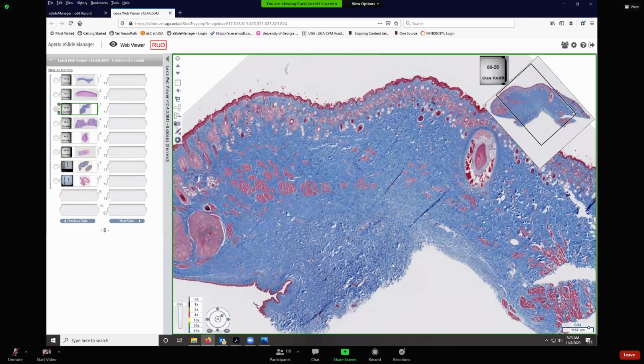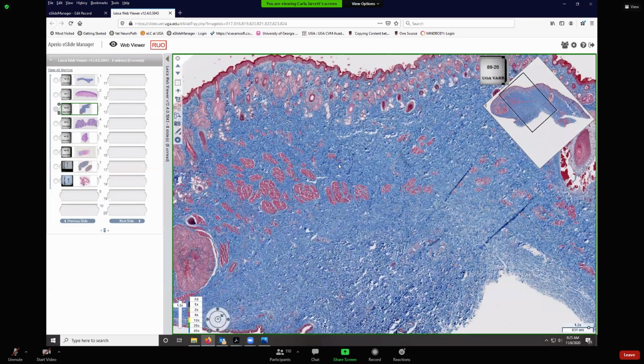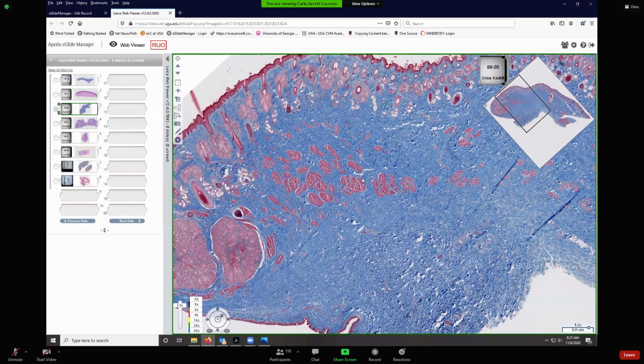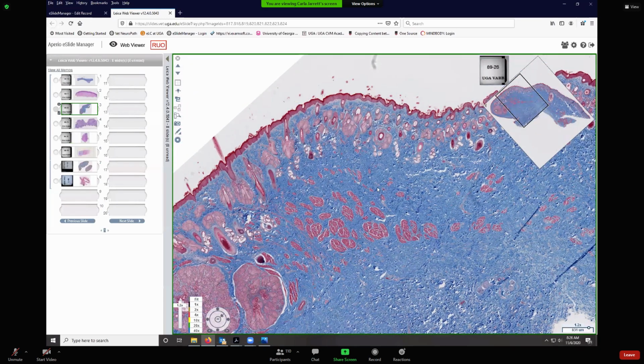Yeah, it's really neat. I just saw some students not that long ago talking about a bacterial folliculitis. So let's look at some hair follicles, because you're going to be looking at bacterial folliculitis, or you'll even be looking at parasites that live in those follicles, demodectic mites. All right, so skin appendages.